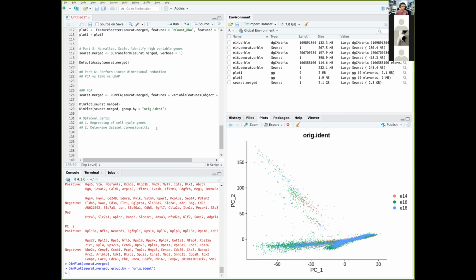For the first part, it determines the cell cycle state of your cells and tries to remove the genes which contribute to the state of the cells. Imagine, just to put it simply, you have 2 cells from exactly the same population, exact same region, but they differ based on their mitosis stage.